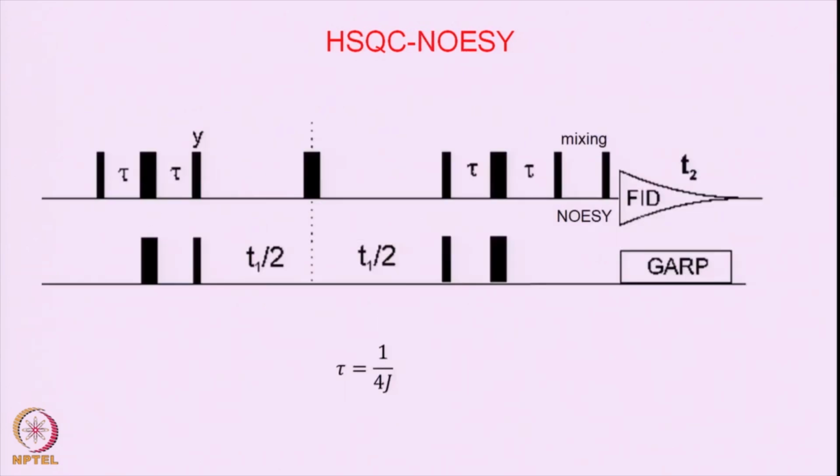So the spectrum will look very similar, except of course for the proton-proton coupling complications which happen as I indicated in the HMQC spectrum. Now, you can also introduce the NOESY. Okay. So now what you do is, up till here the pulse sequence is the same as HSQC, right. So this is HSQC, and from here you come up to this, which is the NOESY.